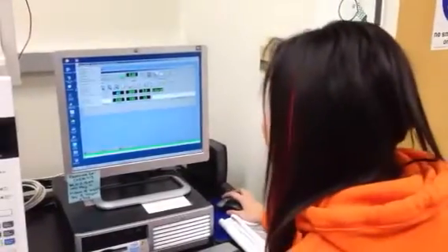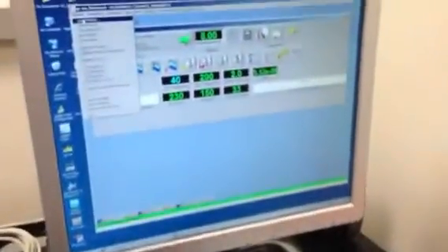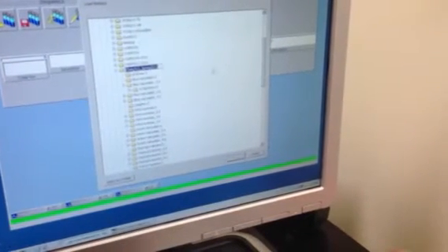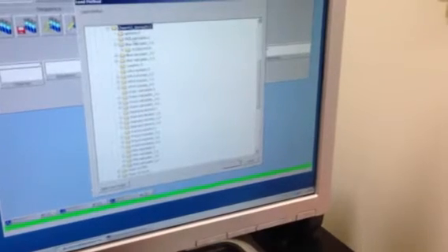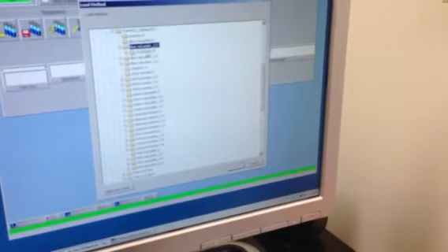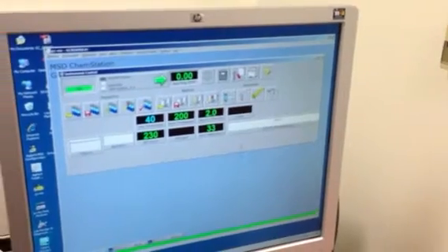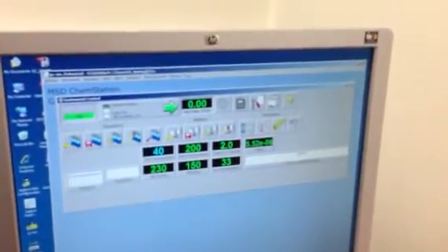First thing you want to do is pick a method to run your sequence. So you go down to Method up here and you select Load Method. On this screen you can pick which method you want to use or you can make a new one. For us it would be under Chem 413, Spring 2013. You click that and then under any of these folders there should be a method. You can make your own, but just click OK if there is one. It should say Ready as it loads the method, and up here you can see the method has been loaded.